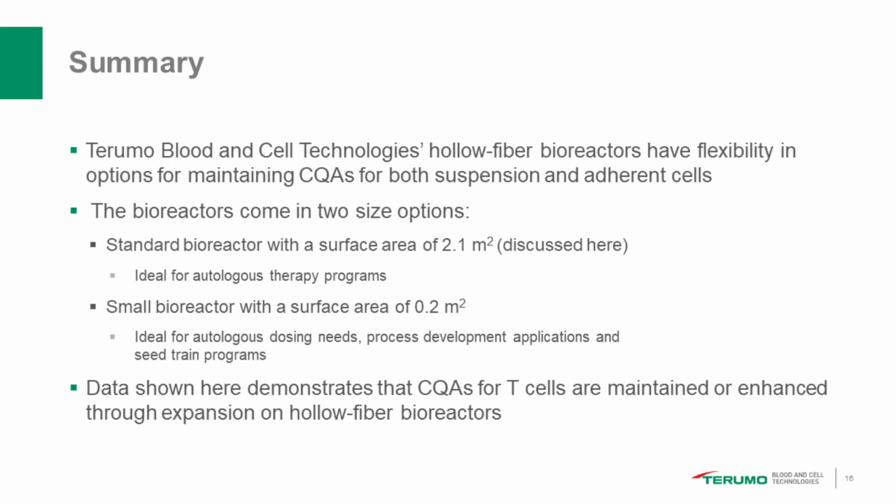You have different options for whether you want low perfusion or no perfusion, and you can feed via a separate circuit. So we have a lot of flexibility in those options as you keep in mind the critical parameters you want to maintain. A lot of options that we can employ in Quantum.